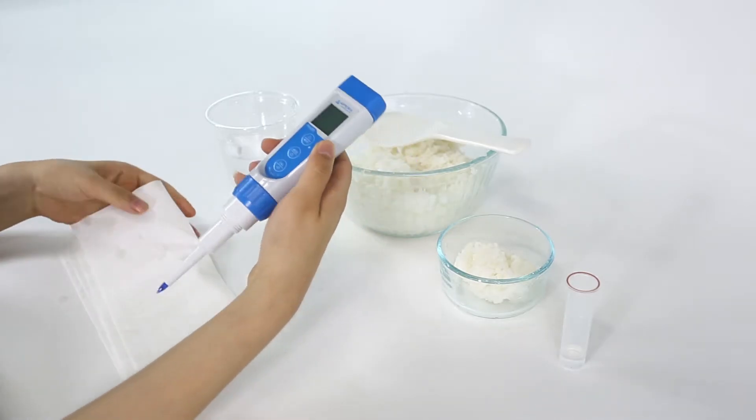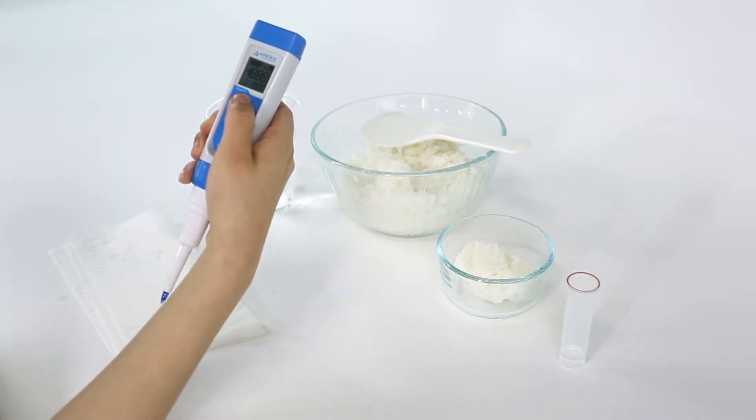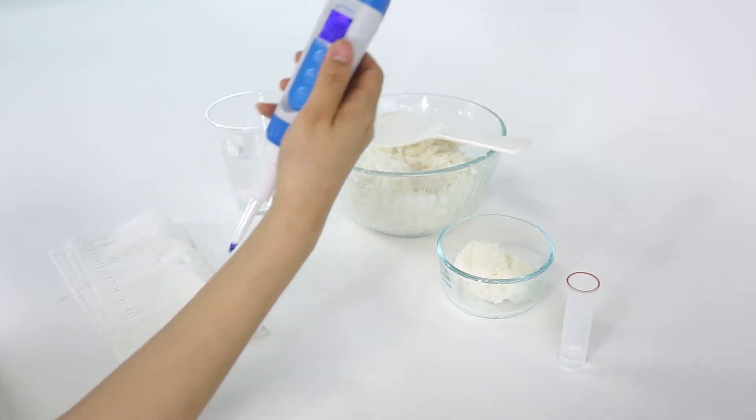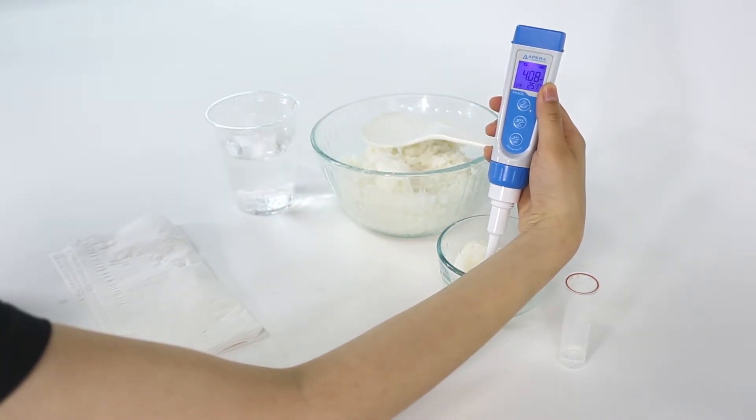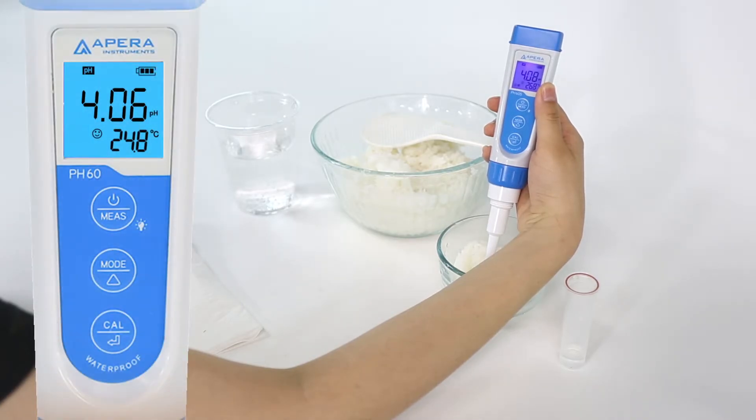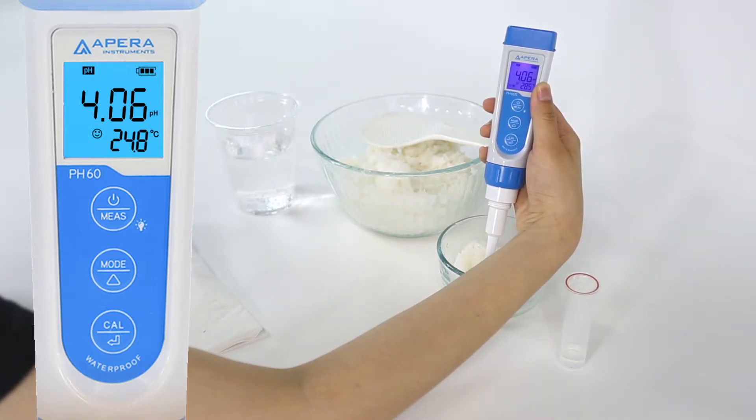Short press the power button to power on. Insert the probe directly into the sushi rice so that the rice is tightly surrounding the tip of the probe. Wait until the smiley face appears — this means the measurement is stable enough for you to read and record.